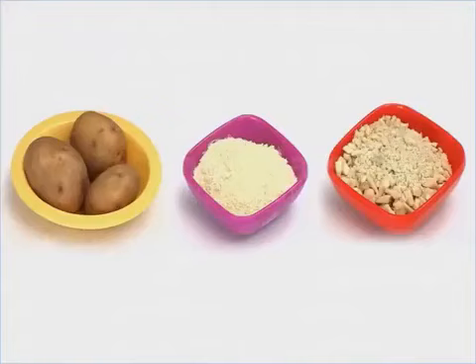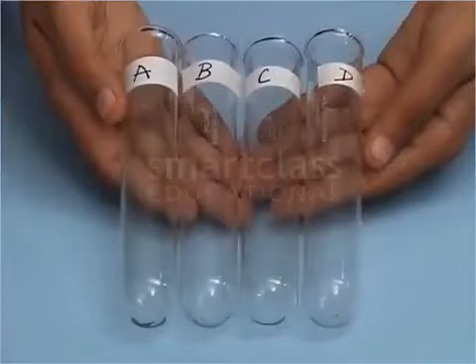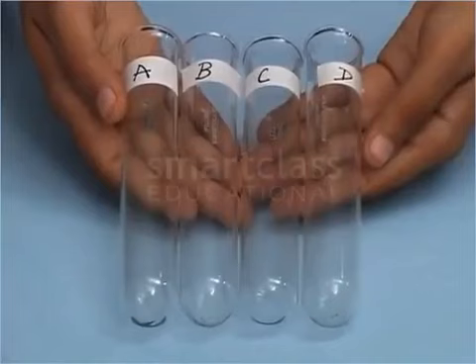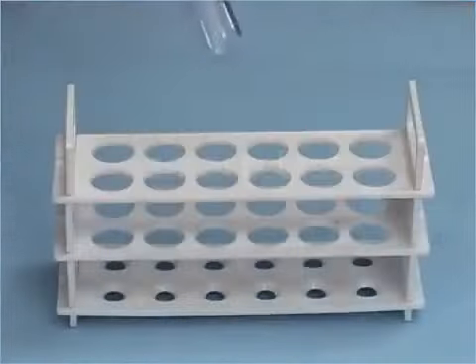Let us now perform the next activity to test the presence of proteins in the food items. First, take 4 test tubes. Now mark them as A, B, C and D and place them in a test tube stand.